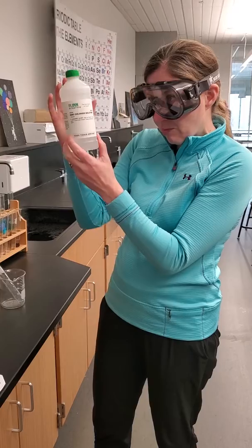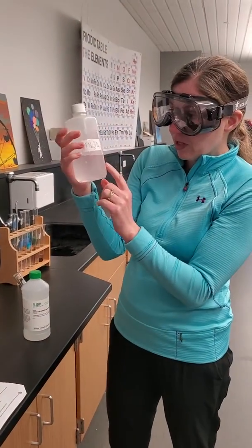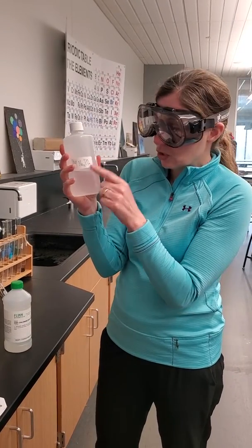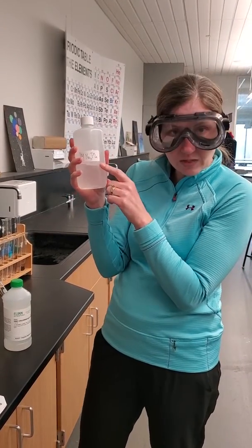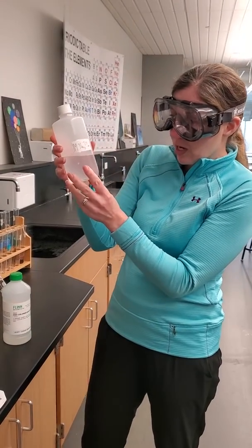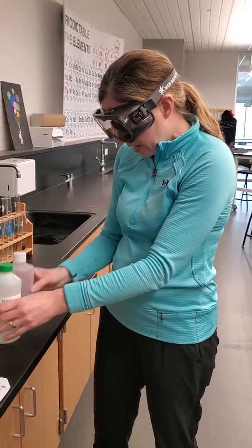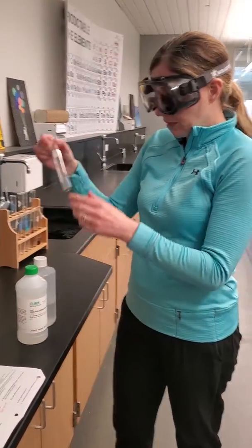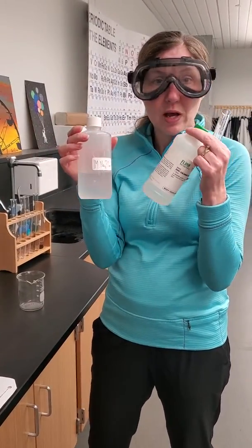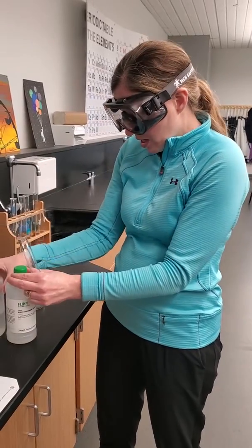We're going to take about 5 milliliters of the zinc chloride and mix it with 5 milliliters of sodium phosphate. Another aqueous solution has sodium ions floating in solution and phosphate ions floating around in that solution, surrounded by water molecules. And so the 5 milliliters of each of them are going to be combined into the test tube. If I have compound reacting with compound, I would expect 2 compounds to be produced. We'll want to figure out what those are.